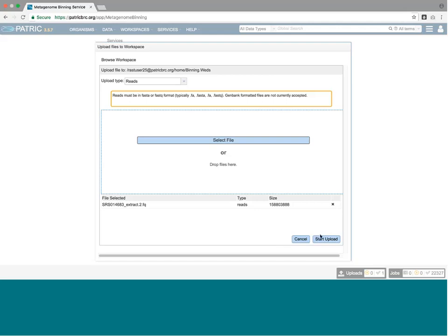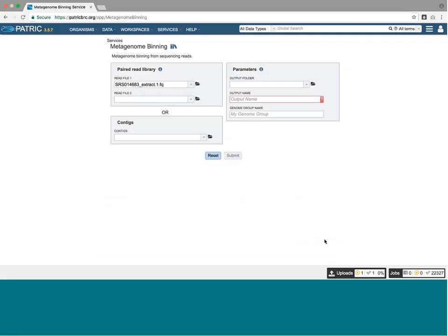Okay, so I'm going to go ahead and make sure to interrupt me, Ron, if I don't answer something completely for folks. Anyway, I'm going to click on the Start Upload to upload the second file. And again, we see in the status window we've got one in progress, which is the one we just started, one completed, which is the one we started earlier, and we're about 20% complete.